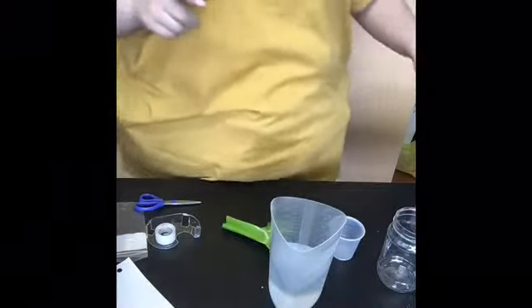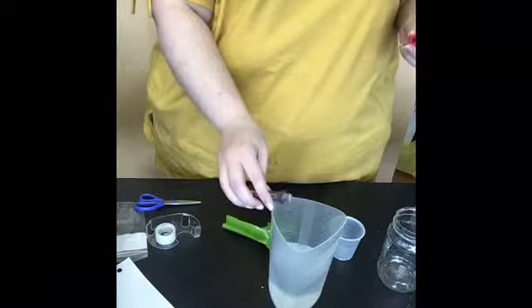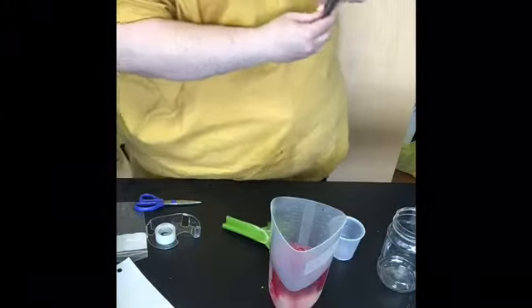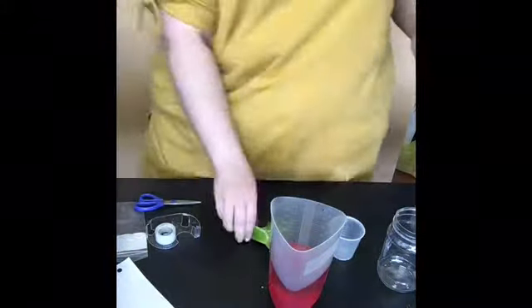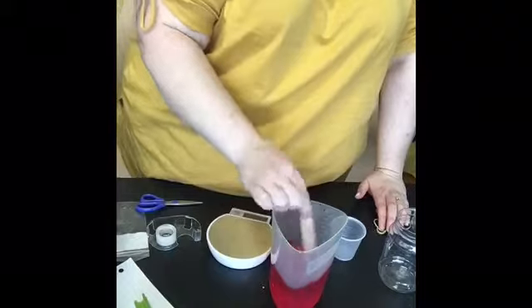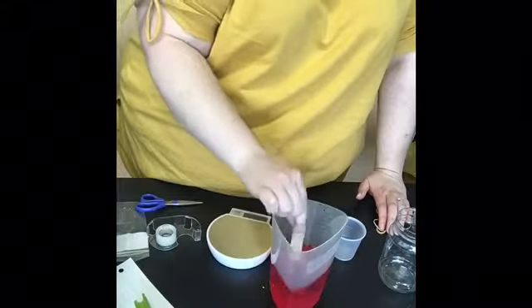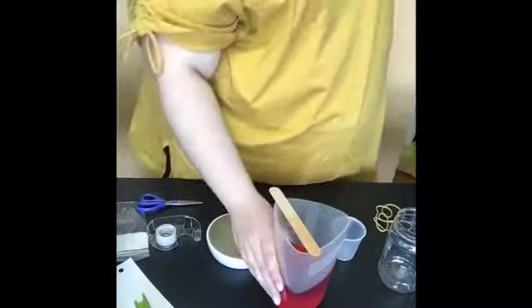We are going to take some red food coloring and dye the water. We're dyeing the water so that it can be more easily seen as it transpires and travels through the celery stalk. I'm using a craft stick to stir and make sure the food dye has gone all the way through. I need 200 milliliters — I have more than that, but I'd rather have a little bit more than not enough.